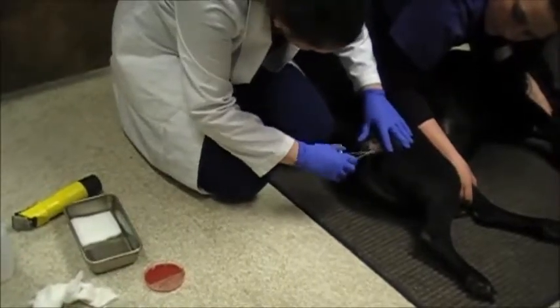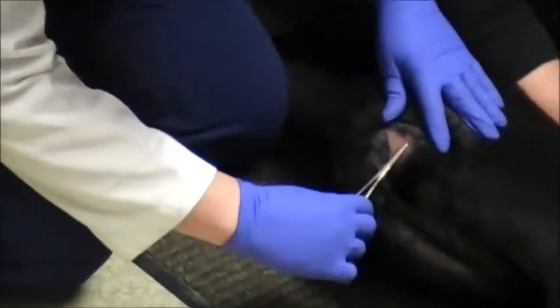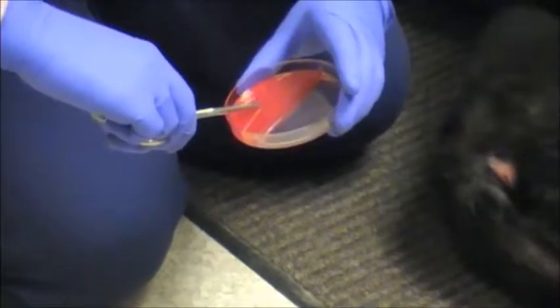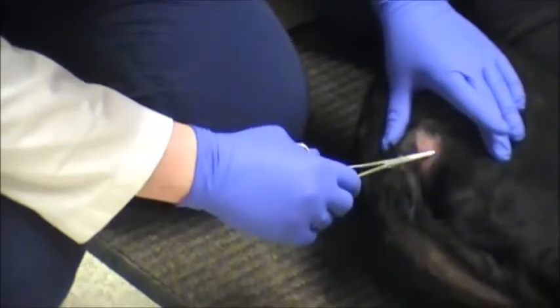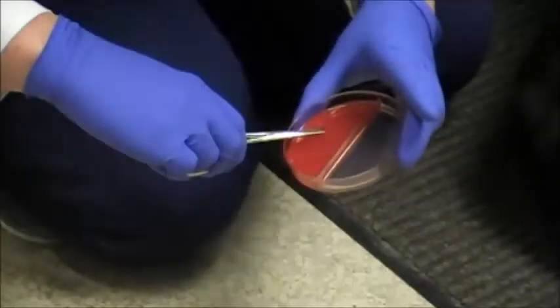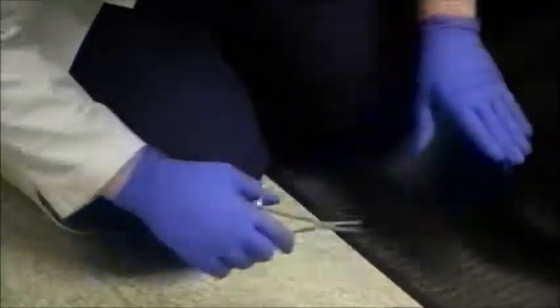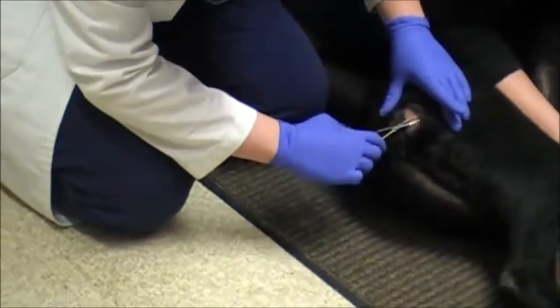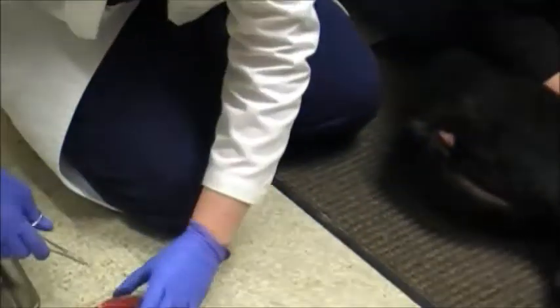I'm going to use my forceps. I want hair that's about 0.3 centimeters, so not long. Then I'm going to take it and push it into my medium. Then I'm going to try to get a little bit of the skin scaling also to put in my DTM. I'm just gently scraping with the tip of my forceps and getting some of the skin. Now I'll push that into my DTM also.